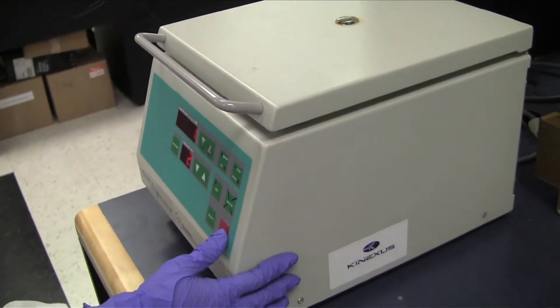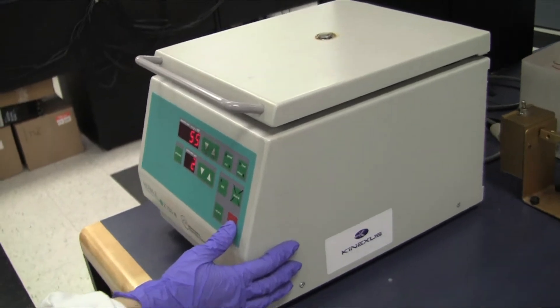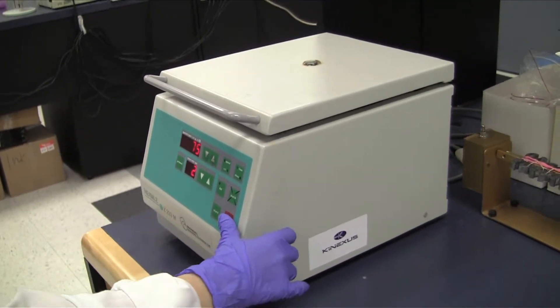Centrifuge the tubes containing the whole labeling reaction briefly at 750 times G.